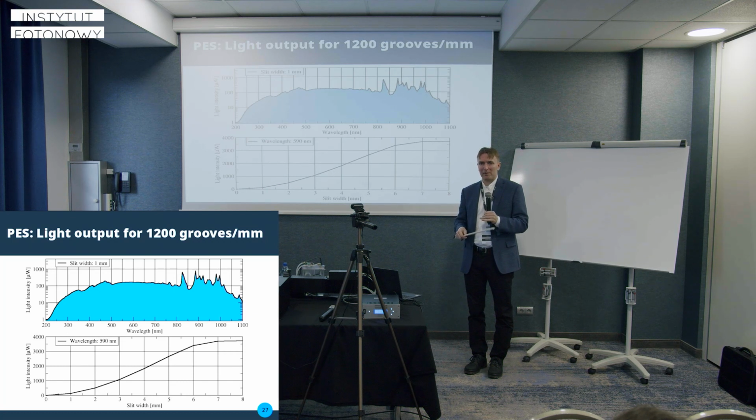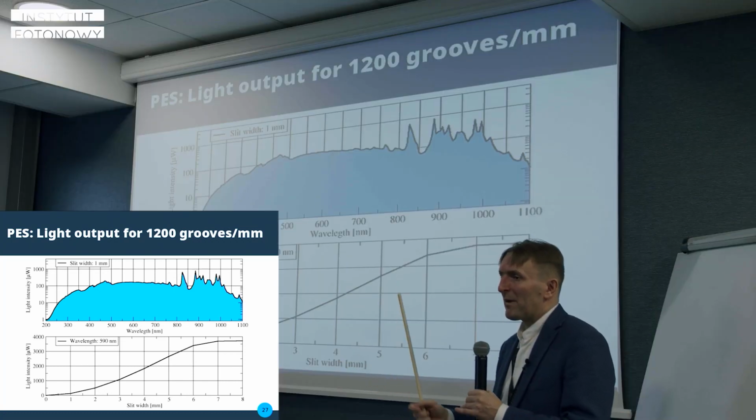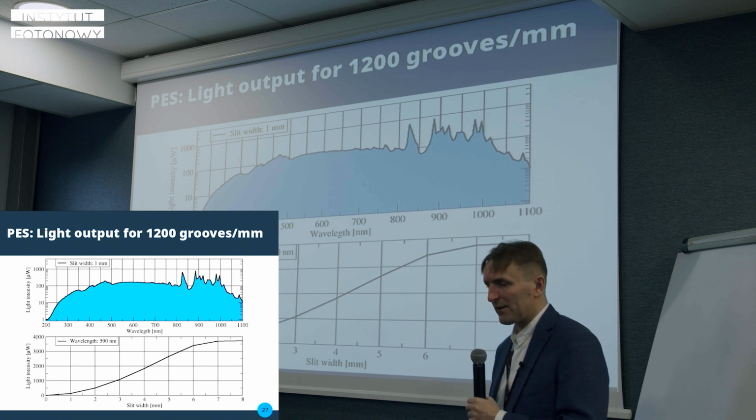It is unstable by its nature, and in order to have it working, you will need to maintain tight currents flowing through the arc. So it is not suitable for changing the light intensity.